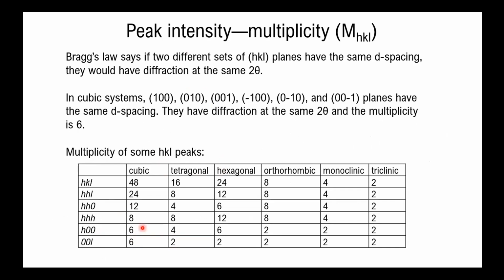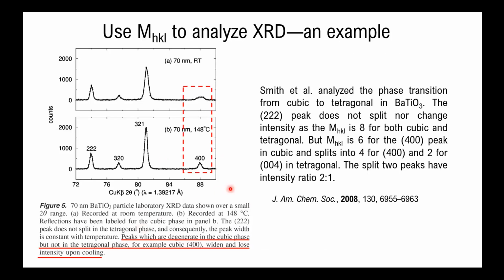So that's in the cubic system. And once the structure distorts and is no longer cubic, it changes to a tetragonal, which means that we no longer have the same A, B, C. We'll have the same A and B, AB are equal, right? But C will elongate or be compressed. So C will be no longer the same as A and B. So that's kind of a change.